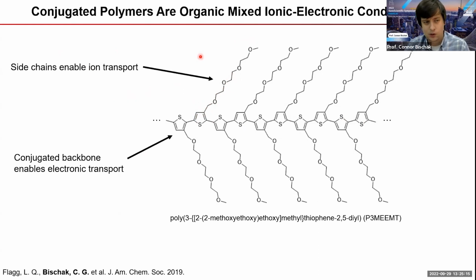These materials are exciting because they can transport both ions and electrons, but also there's a coupling between ion transport and electron transport in these materials, which makes them really useful for applications where you want to convert ionic signal to electronic signal and vice versa.